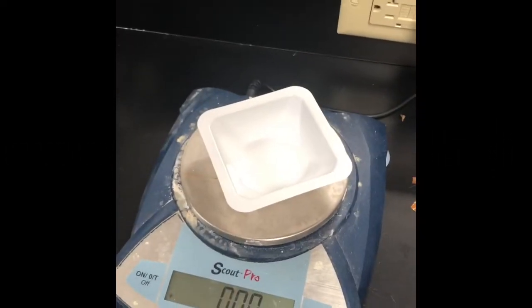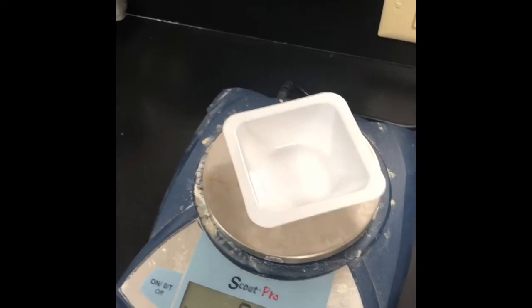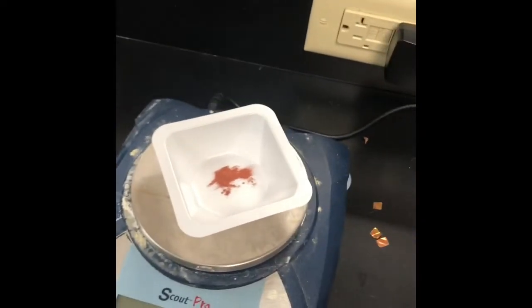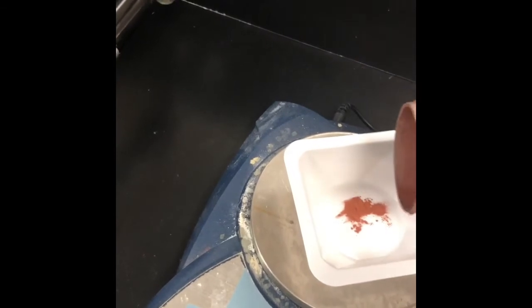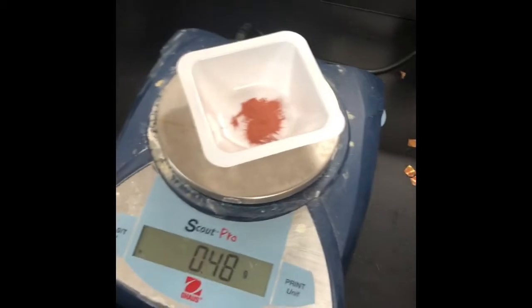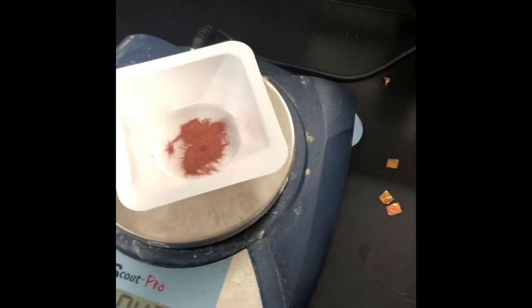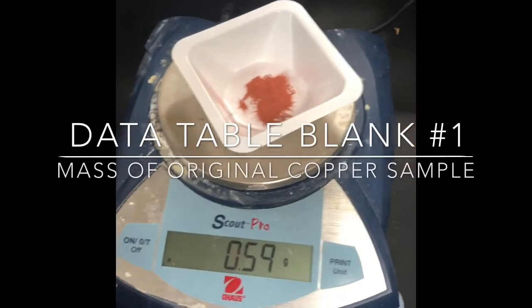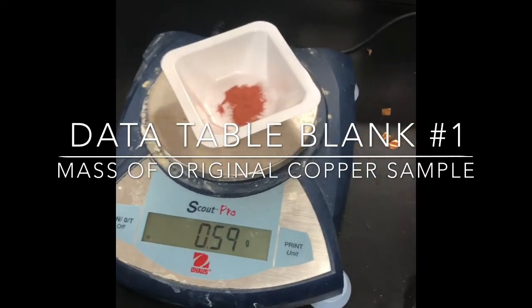So the first step in the lab, it says to weigh out between 0.5 and 0.55 grams of copper. So we're going to be using copper powder. It's like this. We tared out our balance, and we're going to keep putting the copper powder. It's probably easier to sprinkle just a little bit. Okay, that's really close to 0.5, 0.55. Let me see if I can get another little scoop of it. Okay, so we're going to go with 0.59 grams of copper powder. You need to make sure you record this in your data sheet.